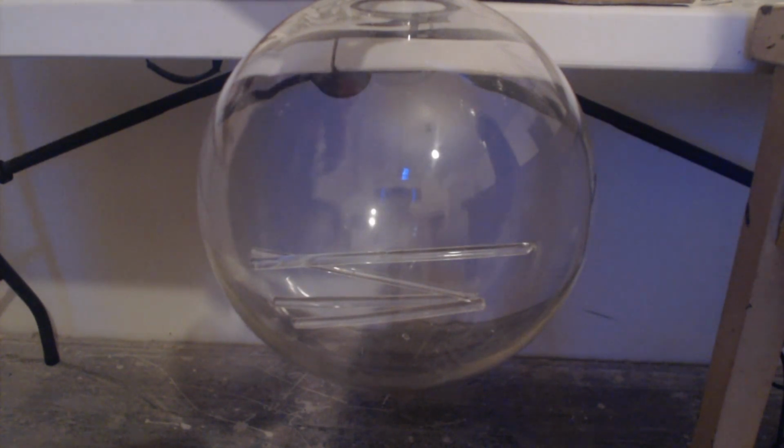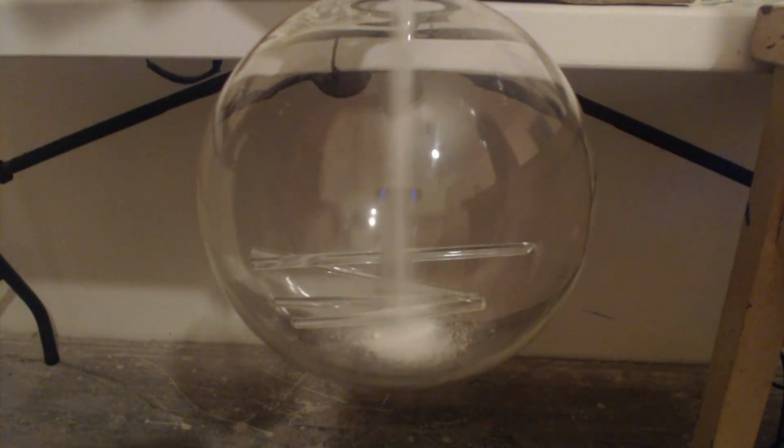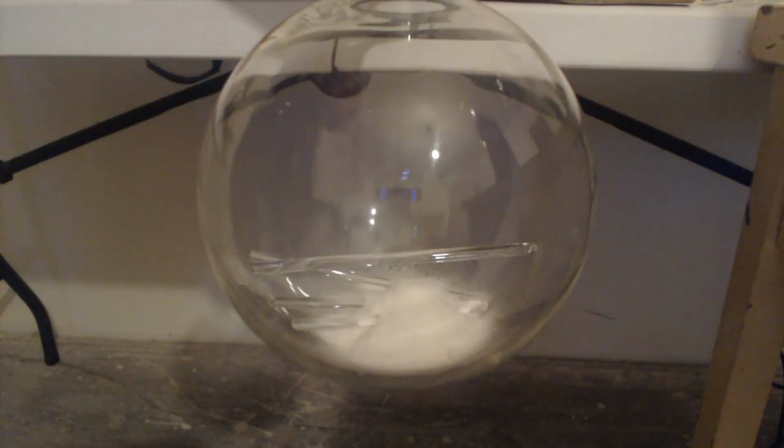My yield in the first video was about 50%. This time it's going to be about 93% or 95% or something like that. I got a 2,000 milliliter round bottom flask with some stir rods in there as boiling stones. I'm going to add into it 303 grams of potassium nitrate, stump remover.